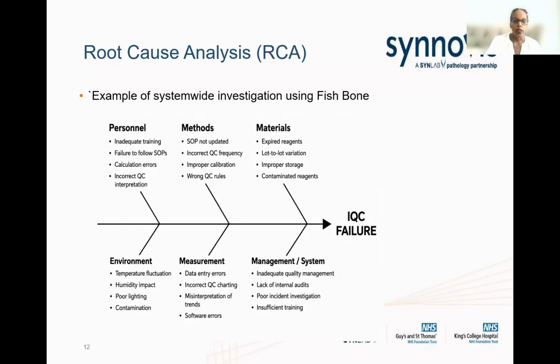And when you talk about measurement, you're talking about data entry and incorrect QC charting. So you're looking at how you're measuring your QC, and misinterpretation of trends. So when you're doing the trends, is it correct? Are the correct values applied? And your software, what kind of software you're using, is it easily accessed so people can play around and change the settings?